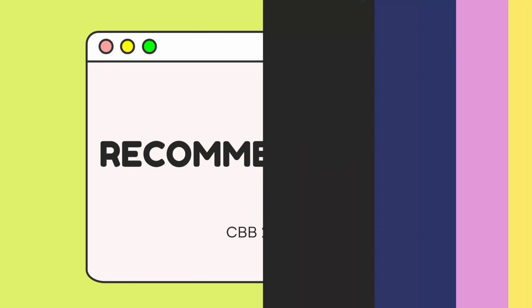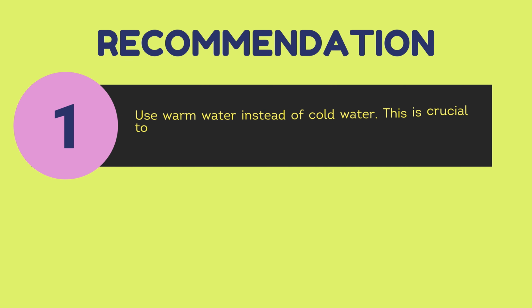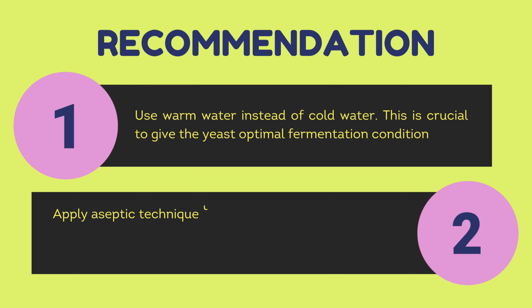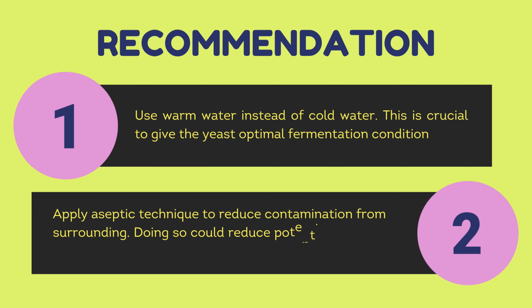Recommendation: use warm water instead of cold water. This is crucial to give the yeast optimal fermentation conditions. Second, apply aseptic technique to reduce contamination from the surroundings. Doing so could reduce potential error in the results.